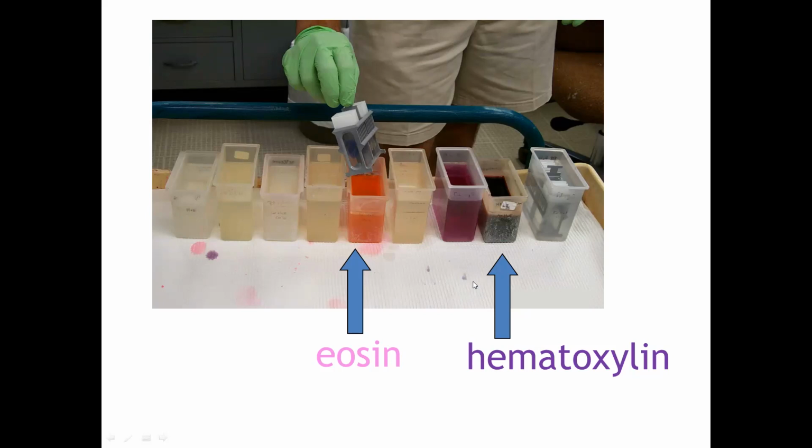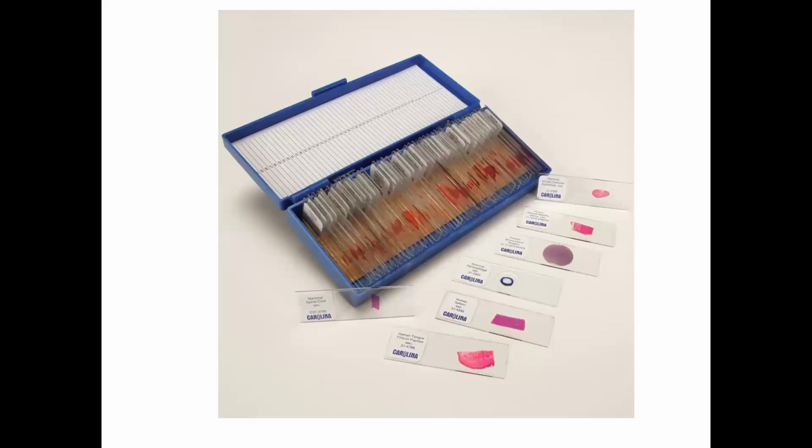This process is also there in the video. So finally, you will get slides like this, right? This is a box of slides which have different tissues prepared and stained the way that I have mentioned.